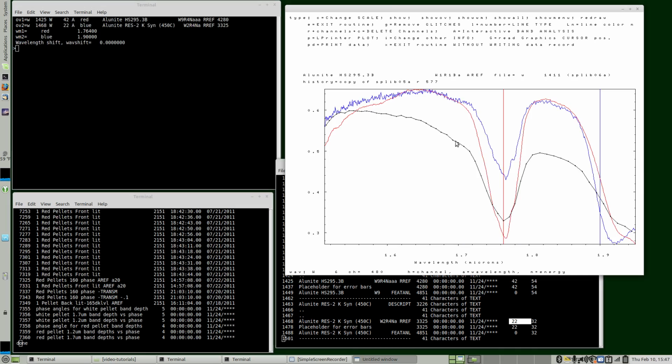Okay, so you'd see for this spectrum, it's a noisier spectrum. We'd have to look at why, but it's obviously high resolution. It's an FTIR. It's probably using a different wavelength source. Anyway, let's not worry about that right now.